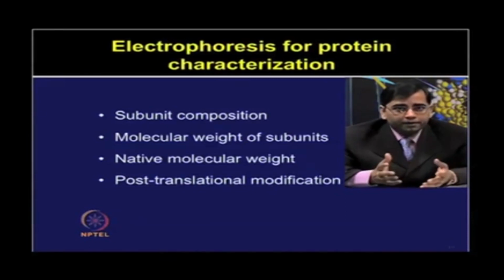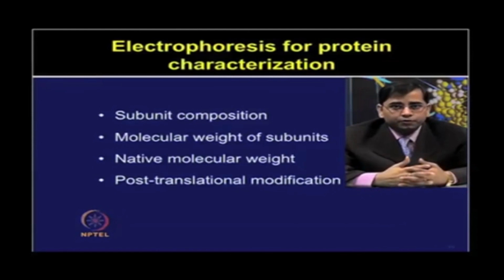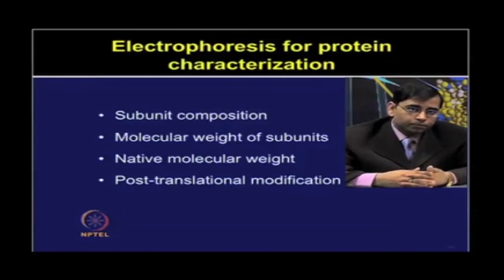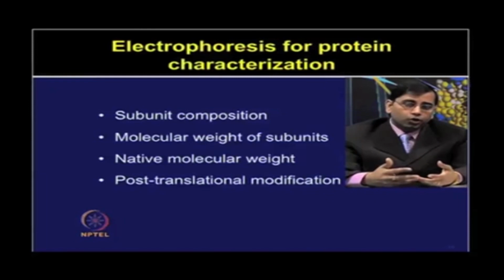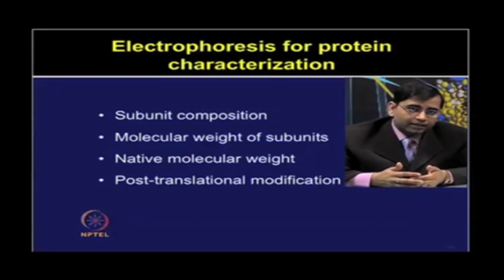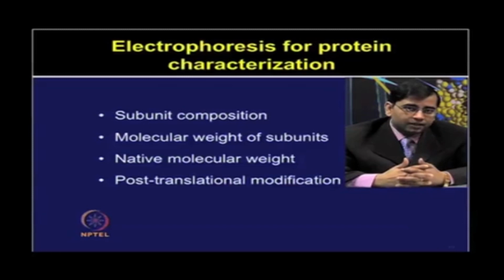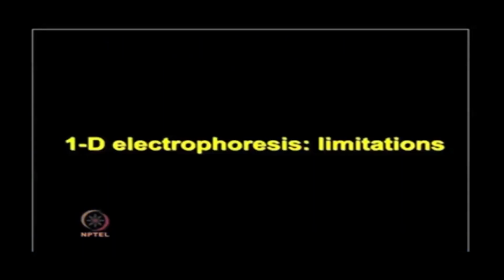If you want to compare the proteins based on their isoelectric point, as well as the separation of isoforms or PTM forms based on the molecular weight, again two-dimensional electrophoresis will be useful. So one needs to know the concept and the laboratory way of using these techniques, so that by applying a combination of the techniques, one can study different types of properties.